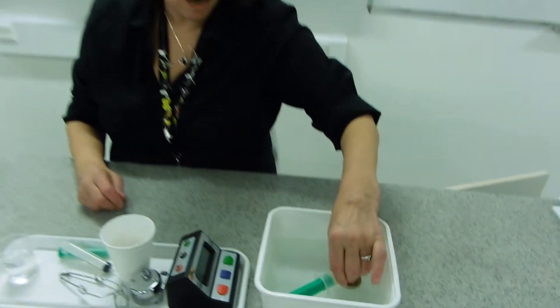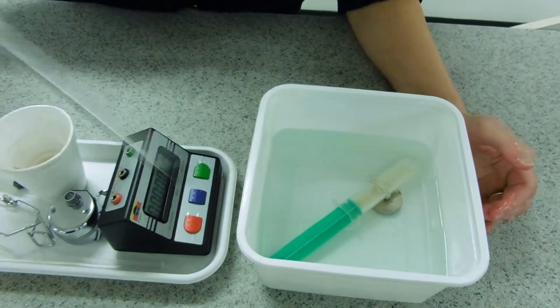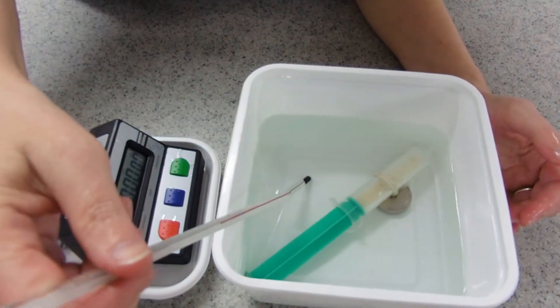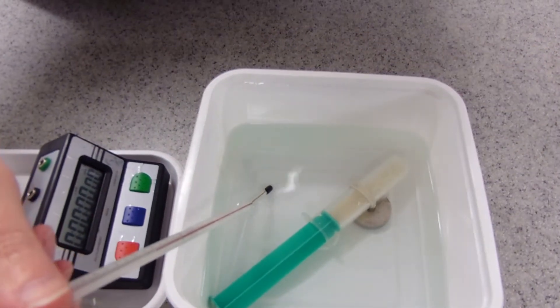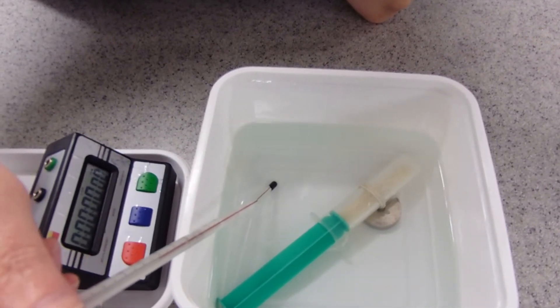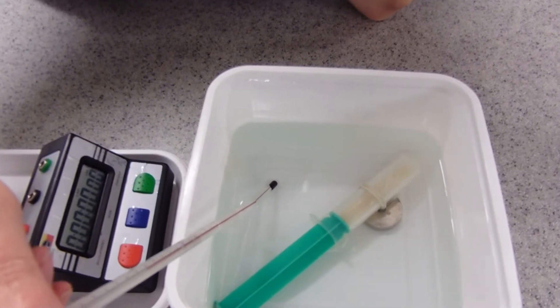Put it into hot water. My water is at about 45 degrees centigrade.